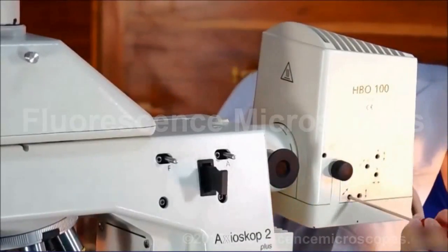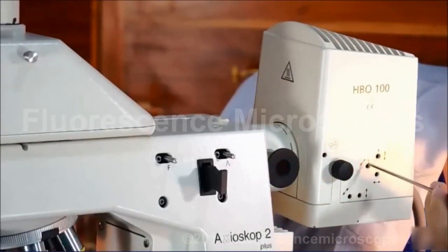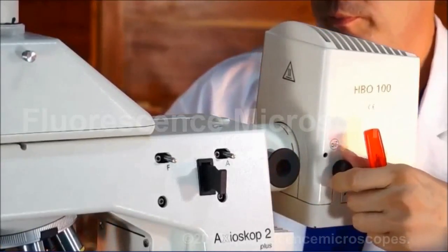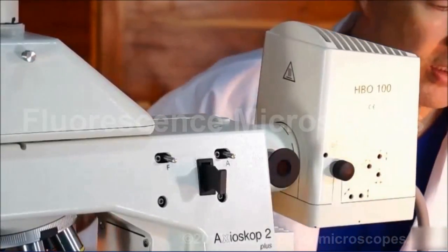And you can use your adjustments, three millimeter hex on these five openings. And you can also use your collector lens to get everything in focus.